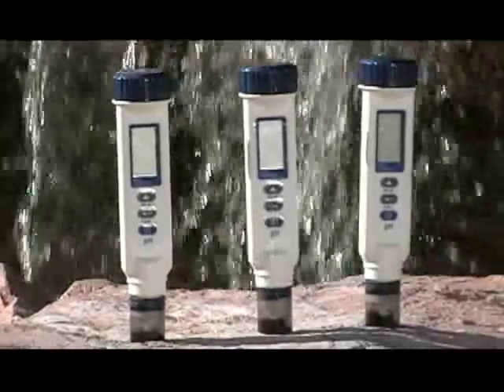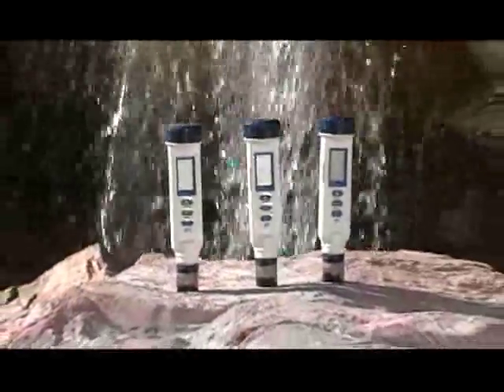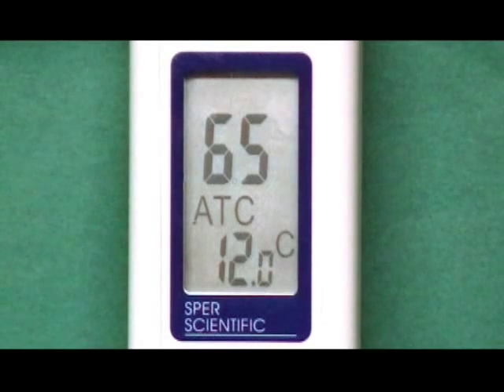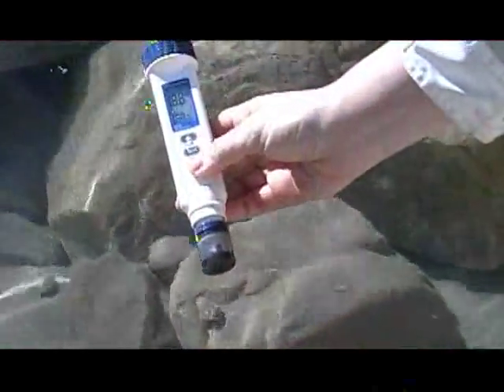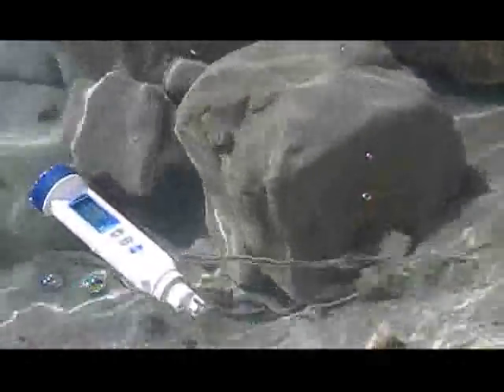Large display pH pens designed for simple one-hand operation with fast, stable, and accurate readings. Models 850051 and 850052 display temperature simultaneously with pH readings. The case is IP65 waterproof and will float if accidentally dropped into water.